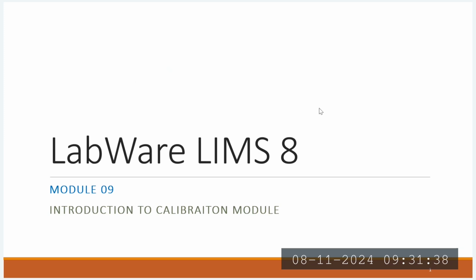Those configurations will be discussed, like how we can configure daily calibrations, monthly calibration procedure, preventive maintenance. When we are going to discuss thoroughly module wise, I will elaborate with the help of the LIMS application screen directly. Just for your understanding, what are the options available in the LabWare LIMS? Just I am elaborating on this.